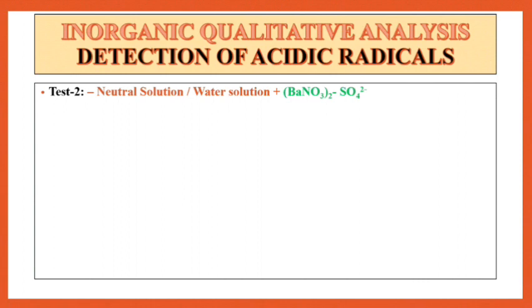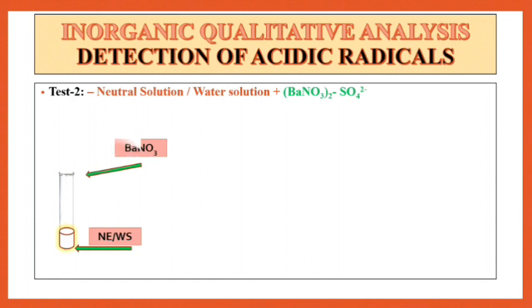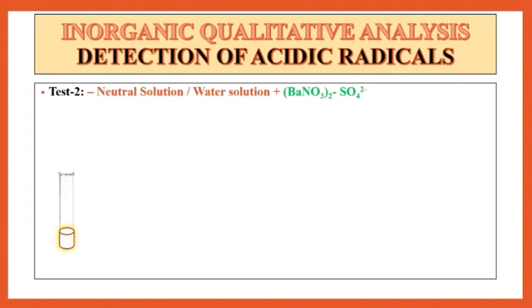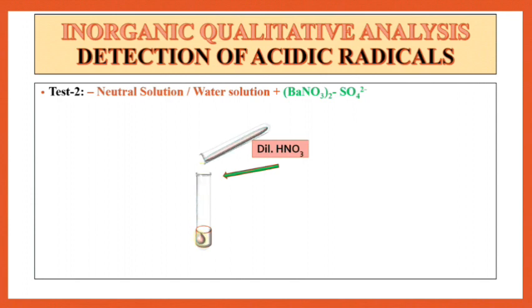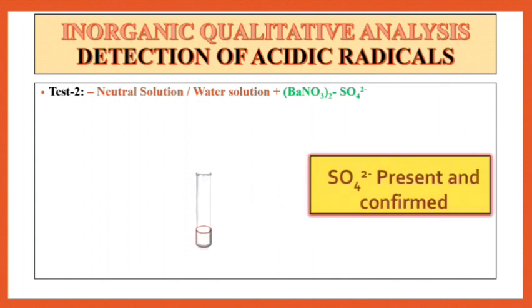Let us see test 2. It is for the detection of SO4²⁻ radical. For that, take neutral extract or water solution. To this solution, add Ba(NO3)2 drop wise and shake it well. If a white PPT is observed, then add dilute HNO3 drop wise and shake it well. It is insoluble. So SO4²⁻ is present and confirmed.